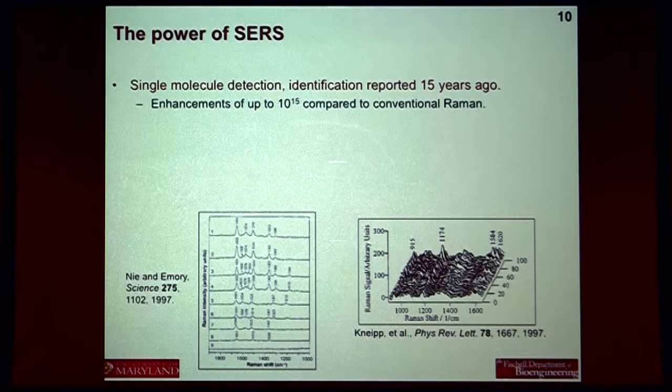Right. So just to look at how powerful this can be, even 15 years ago, so SERS as a field is about 40 years old. About 15 years ago, a few different researchers actually were able to identify a single molecule using SERS. So for the first 25 years of SERS, it was kind of a fringe chemist thing to do. When these two papers came out, the bandwagon was rolling, and people started jumping on.